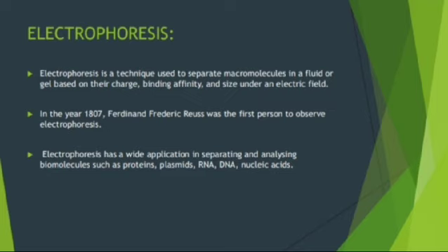In the year 1807, Ferdinand Frederick Reuss was the first person to observe electrophoresis. Electrophoresis has a wide application in separating and analyzing biomolecules such as protein, plasmid, RNA, DNA, and nucleic acids.